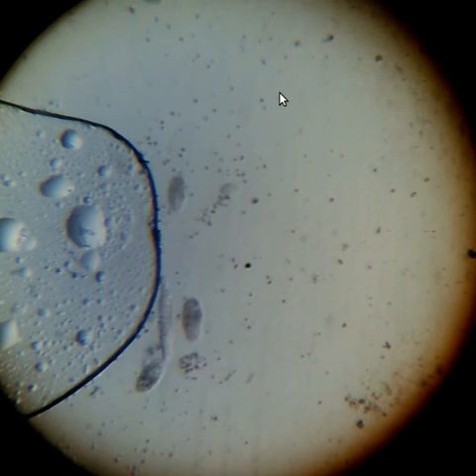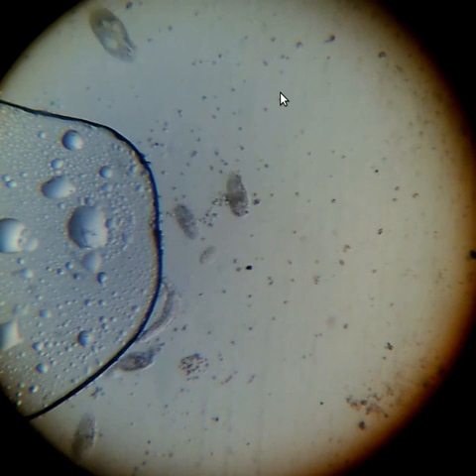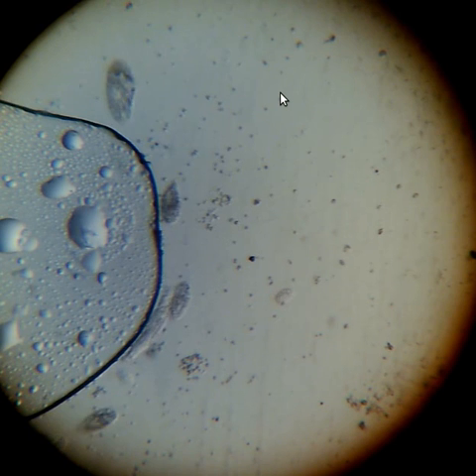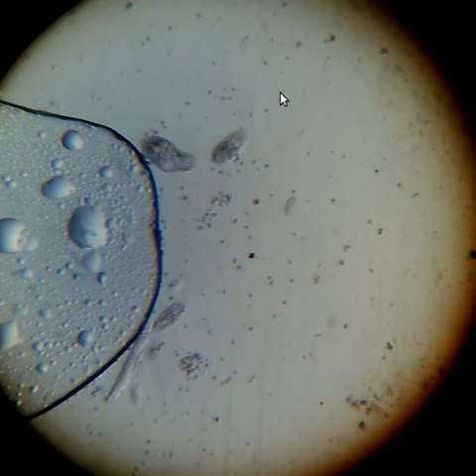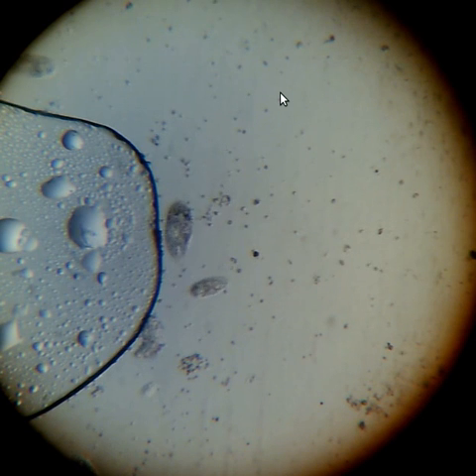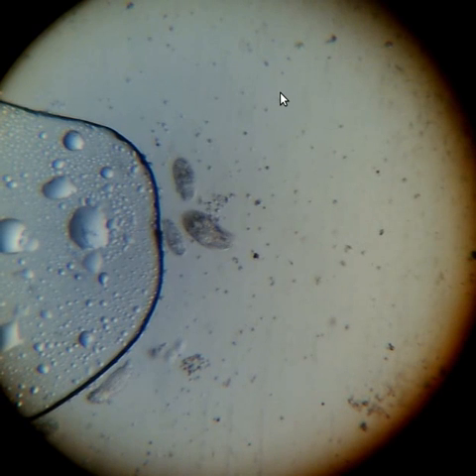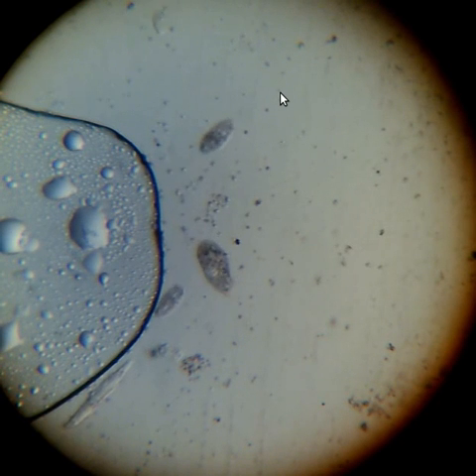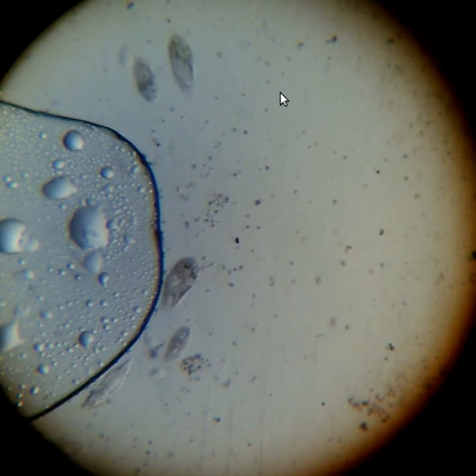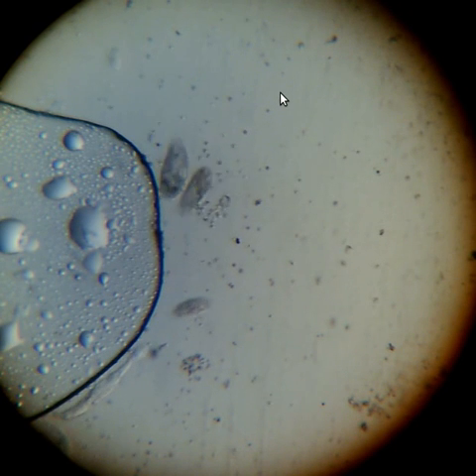The protozoa — you might be able to see that they're creating a current and sucking the small organisms around them. They're actually sucking some of the smaller guys in. Just watch how the small guys move towards the front, towards the mouth of the larger protozoa.